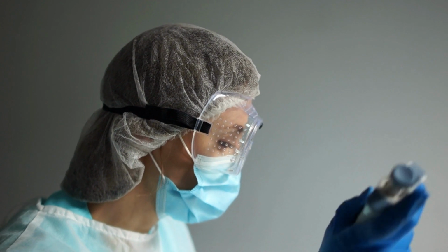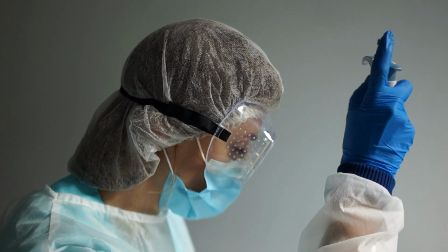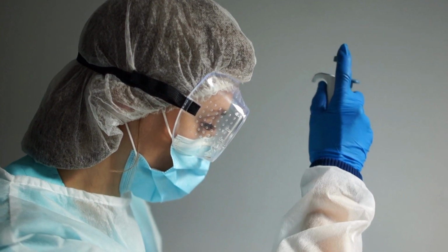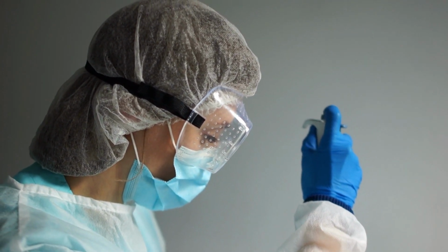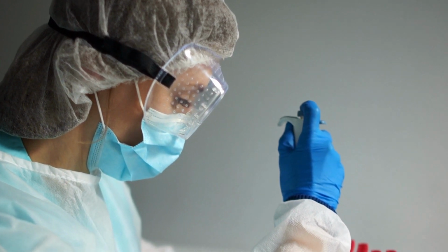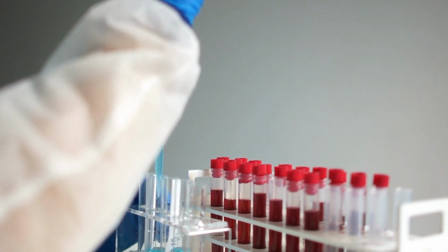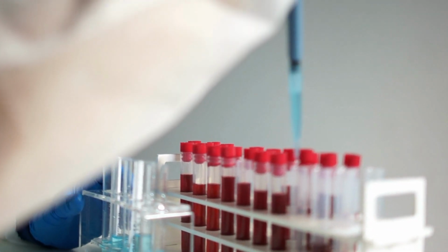In conclusion, ELISA is a powerful technique in modern biology and medicine. It allows researchers and clinicians to detect and quantify a variety of analytes in biological samples and can be adapted for many different purposes. Overall, ELISA is a sensitive, reliable, and versatile assay that has revolutionized our ability to understand and manipulate biological systems.